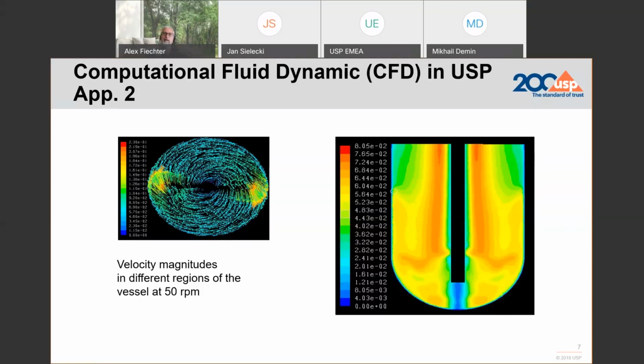So our experience has shown that the more flat this peak is, the more vibration you have, either coming from the dissolution tester itself, the motor, stirring elements, circulation pump, or whatsoever, or nearby sources. In the worst case, you have a centrifuge apparatus just next to the dissolution assembly that is really applying vibration to the tester.